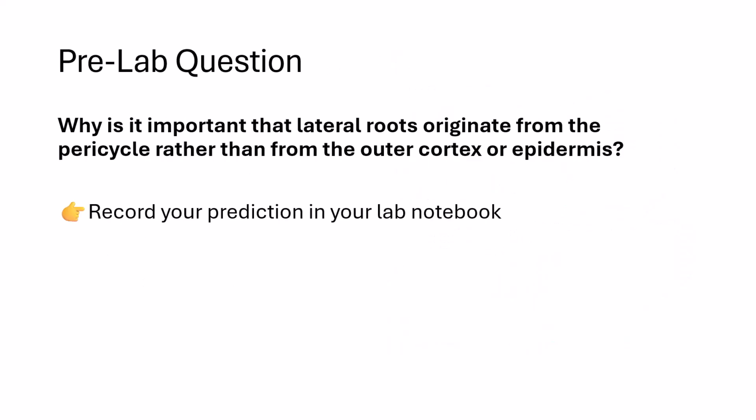Before you analyze the slide images, think about this question. Why is it important that lateral roots originate from the pericycle instead of from the cortex or epidermis? Think about vascular connections, transport, and structural integration. Write your prediction in your lab notebook before continuing.